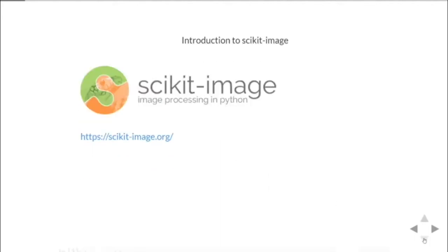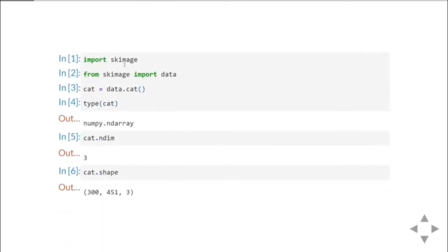Once you have installed scikit-image, you can import it. First, you will have to launch your favorite Python IDE or code editor. I recommend that you start a Jupyter Notebook because it's particularly suitable for exploratory data analysis, and more generally, it's a very user-friendly and versatile tool. For example, this very slideshow is based on a Jupyter Notebook.